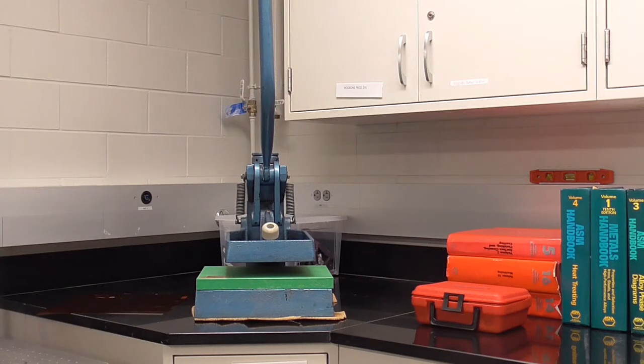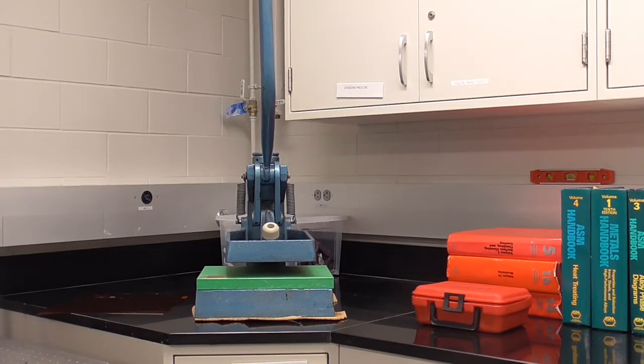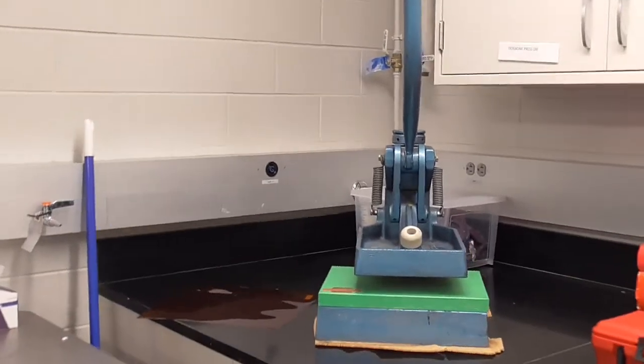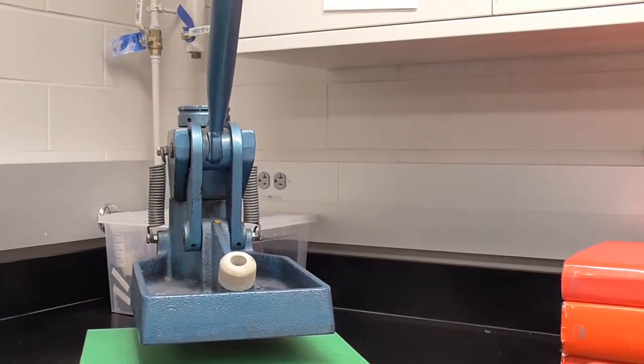In the lab by the 5,000 newton Instron, we have a polymer press where you can press polymer films and dog bones.